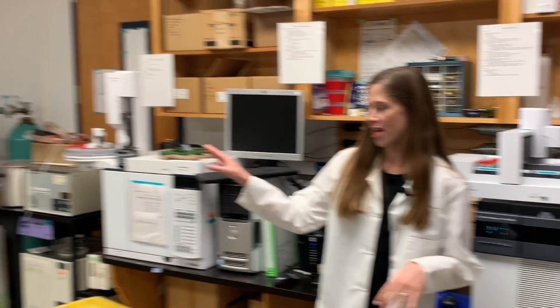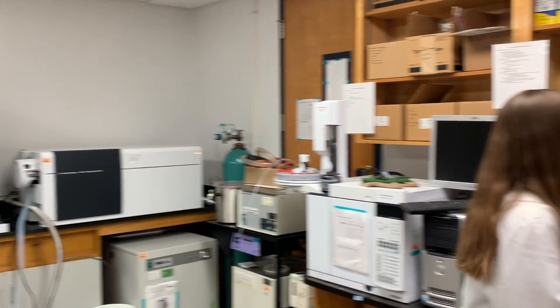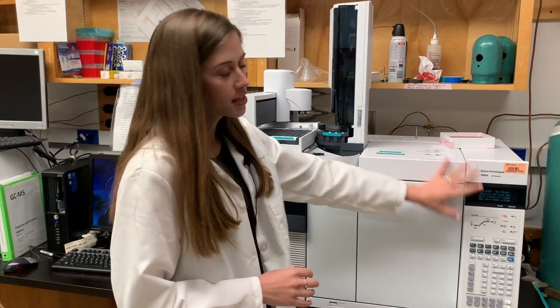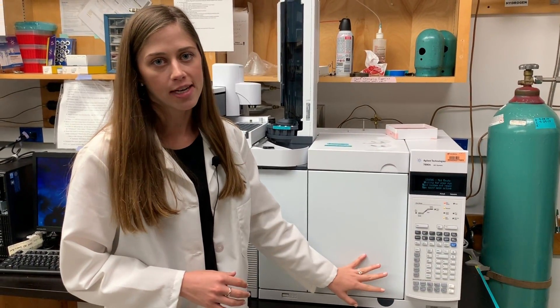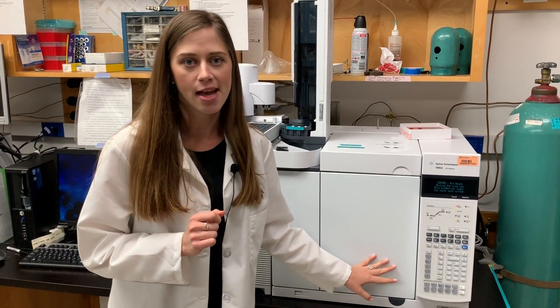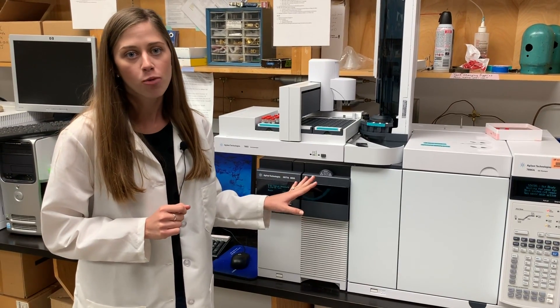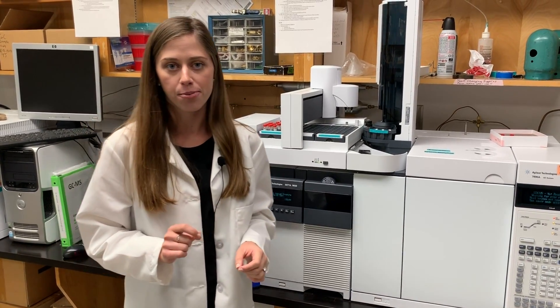And now for the most expensive pieces of equipment in our whole lab — our GCMS and our LCMS. The GCMS is large analytical chemistry equipment that we use to study the different compounds that make up flavor and aroma, the scents of different flowers, and the taste of strawberries. This part is the gas chromatography where we can separate out the different compounds in a sample, then each compound makes its way to the mass spectrometer, which can ID each compound by a fingerprint.